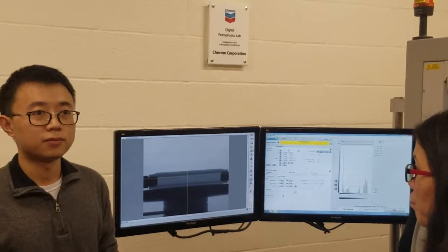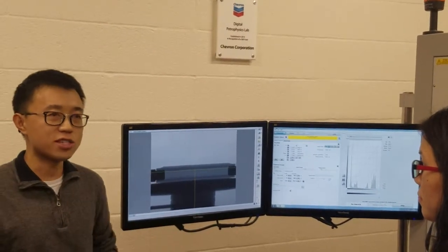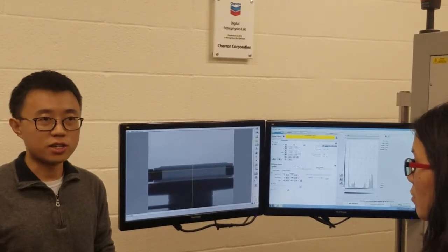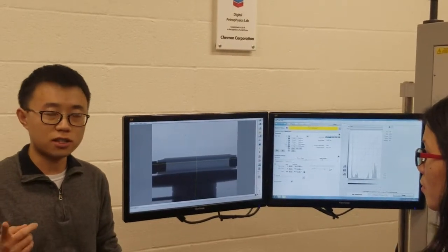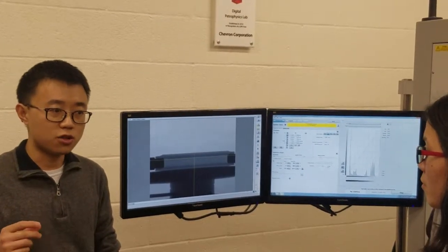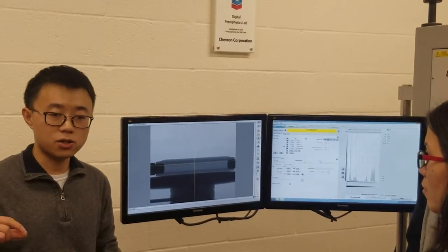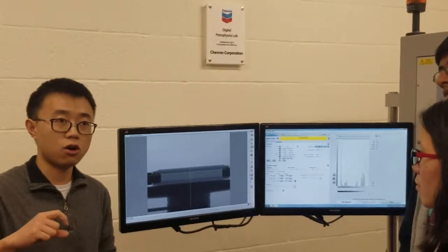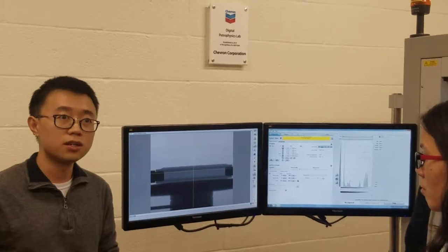So for any fluid experiments, you don't get real-time data. No, you cannot achieve that using the microCT unless you inject very slowly. But you can actually do these 2D radiographs like what Jasper did. You take radiographs at very small intervals, so you can record how the saturation of your sample is changing over time.